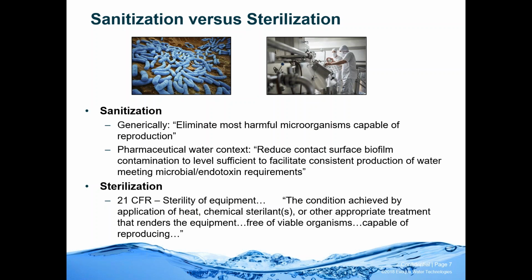Sterilization is defined in a few different places, but in this one, in sterility of equipment, it is a condition achieved by application of heat, chemical sterilants, or other appropriate treatment that renders the equipment free of organisms capable of reproducing. So in that case, sterilization would be a goal of sanitization, to eliminate them. It isn't a requirement. And when you're sanitizing, even if you never got a micro count in your water, you could never call that sterile.